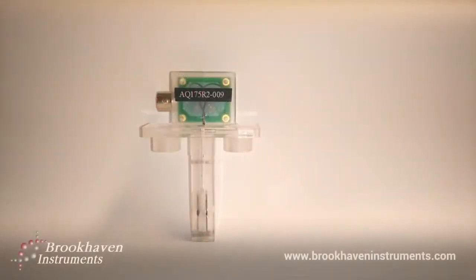In this video, I'll be demonstrating the use of our small volume electrode, the SVE-175.